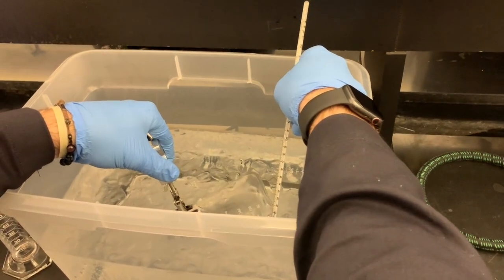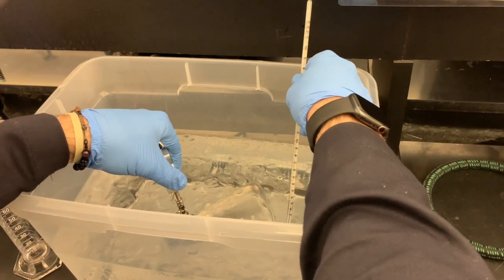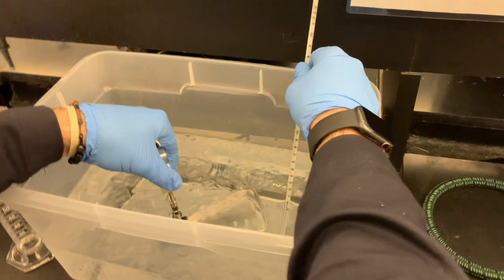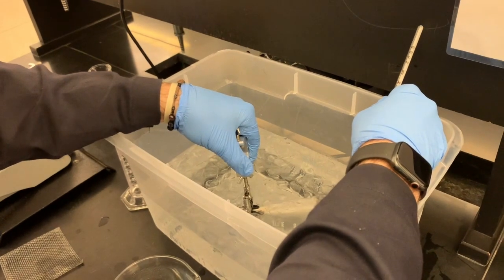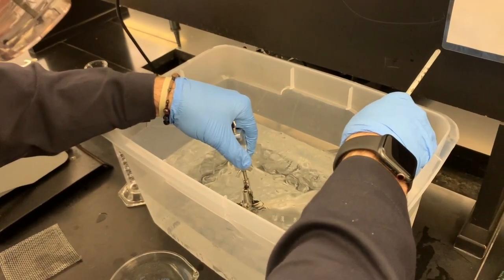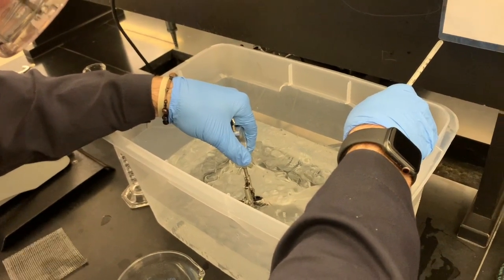This only needs to go on for about 3 or 4 minutes. The temperature change will be pretty drastic. Air is kind of an insulator, so more time is usually a little bit better. But the more time you have it down there, the more chance you have of accidentally knocking some air into it that shouldn't be there, or water into it that shouldn't be there. Kind of a best of both worlds situation. So we're starting to settle the temperature at about 1.9 degrees Celsius.